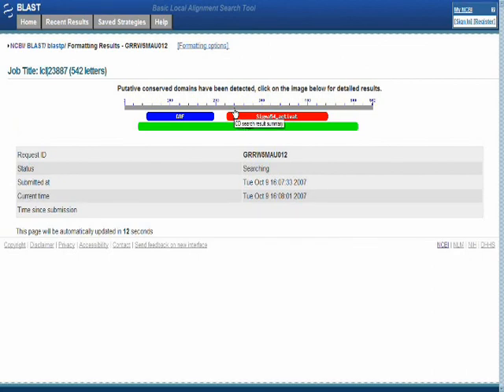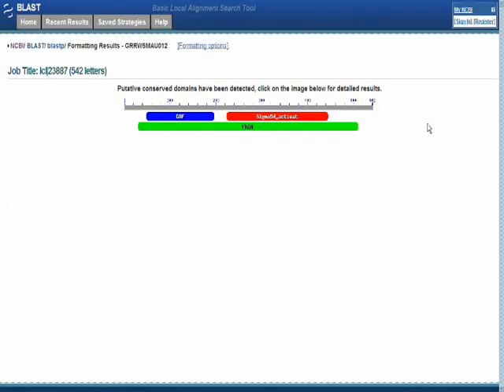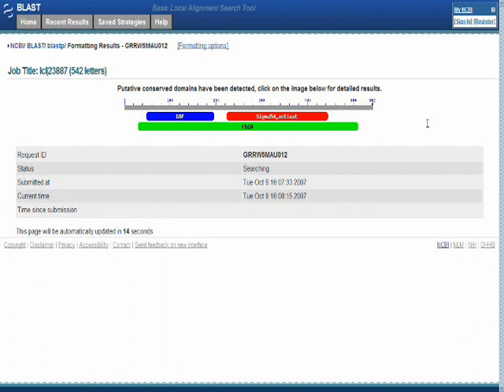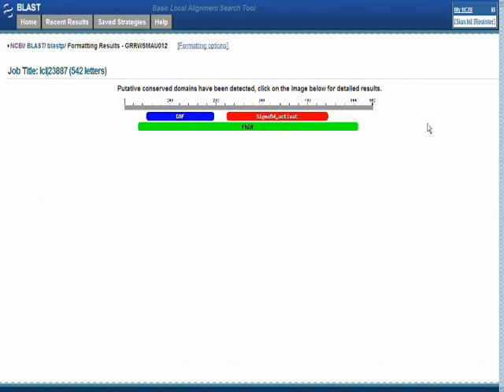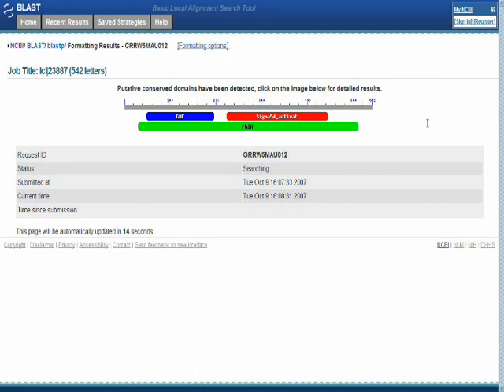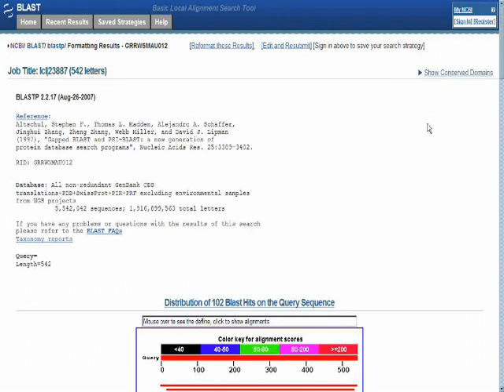This will show us in cartoon form potential matches to our sequence based on conserved domains that are located out there in the databases. Of particular interest is the red region, which suggests this is a sigma factor of some sort. Sigma factors are DNA binding transcription regulatory factors in prokaryotic cells. That's an interesting finding in and of itself. Our candidate sequence may encode for a DNA binding regulatory factor in bacteria.